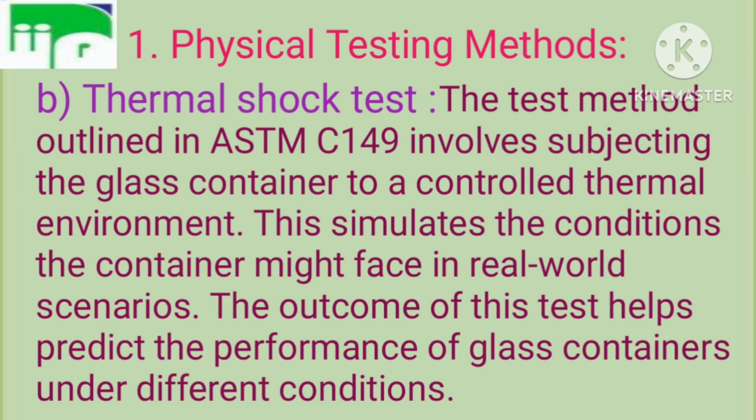Second testing method is thermal shock test. The test method outlined in American Society for Testing Materials C149 involves subjecting the glass container to a controlled thermal environment. This simulates the conditions the container might face in real world scenarios. The outcome of this test helps predict the performance of glass containers under different conditions.